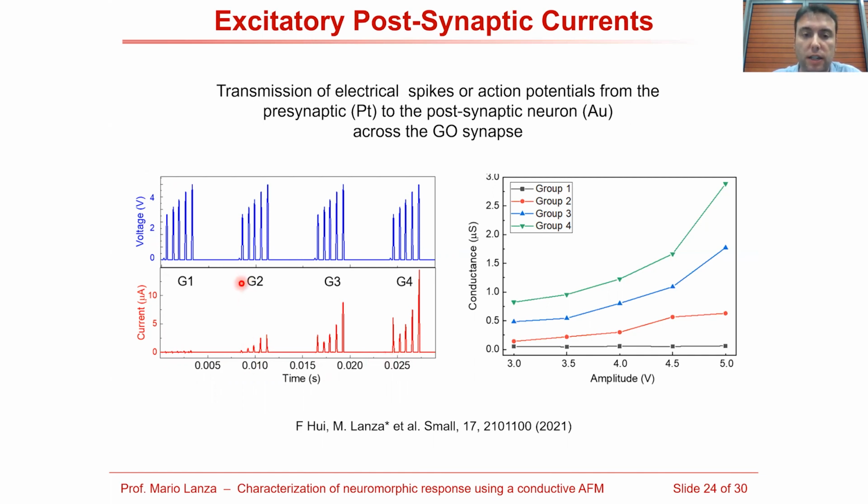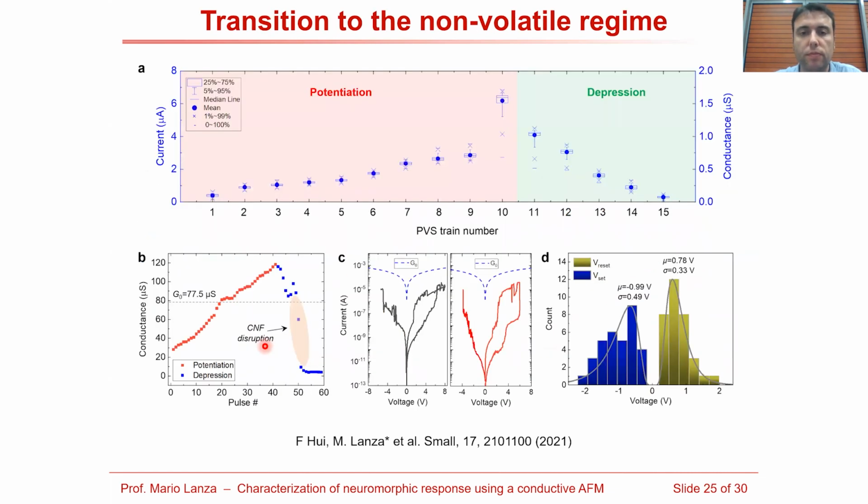We observe something interesting, which is between the last pulse here and the next one, there is a relaxation, which is also confirming the presence of this threshold region. So in the next step, we try to apply a little bit higher pulses. And what we observe is that we can start to increase the current across this system nearly linearly, again, as shown in the previous example. We can also see the depression.